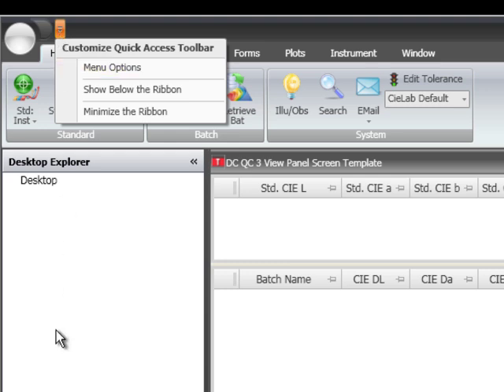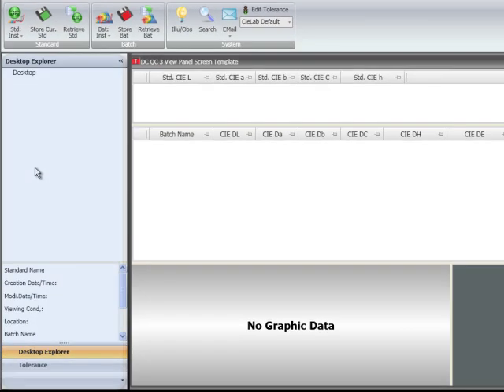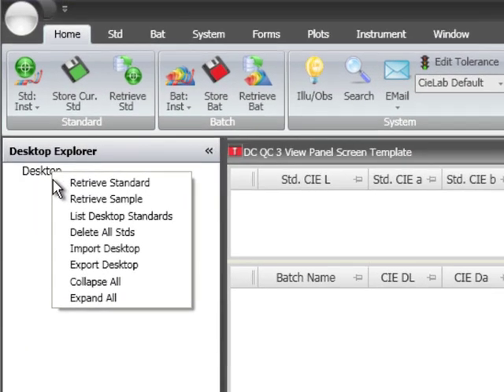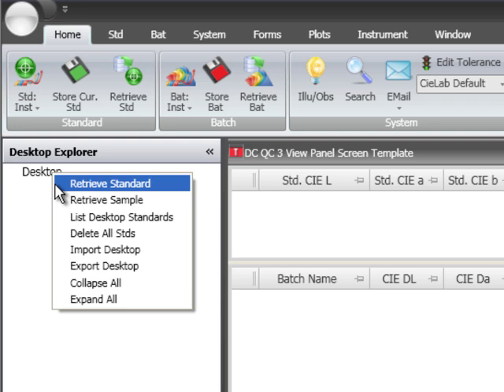On the left side of the screen resides the desktop explorer. This is the primary area for data management. The desktop explorer has streamlined the approach of accessing data by introducing Windows features. For example, many options can be displayed by using a right-click function on a desired object. A right-click on the word desktop allows the user to retrieve, list, delete, and import standard data.